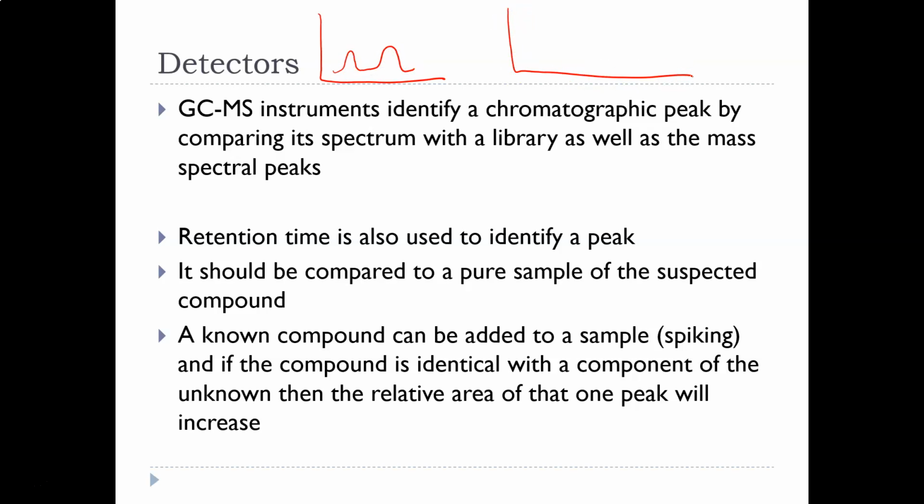It's the chromatogram. And then if we have an unknown chemical, but then I added some cyclohexane, because I think there's cyclohexane in it, this is what would happen. That tells us, hey, there is cyclohexane, because I added more of the chemical, and what it did was it made one of the peaks bigger. So that peak is cyclohexane. And if you took Gen Chem 2 at St. Charles Community College, the first lab, the one where you used gas chromatography, you did exactly this to identify which peak was which for an unknown sample. Okay, with spiking.